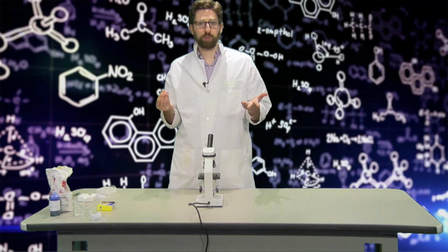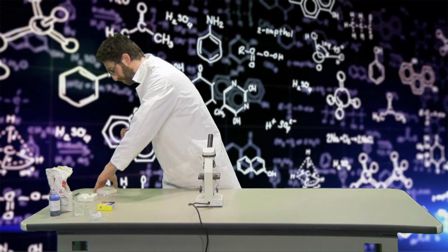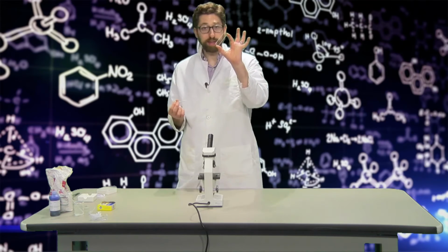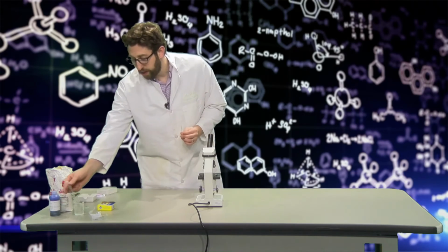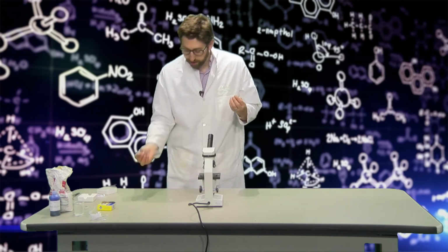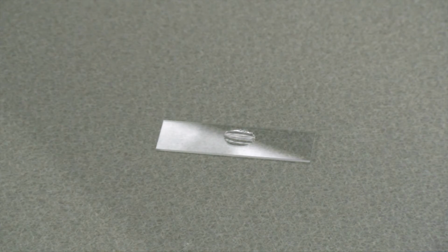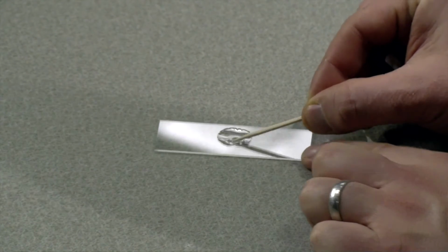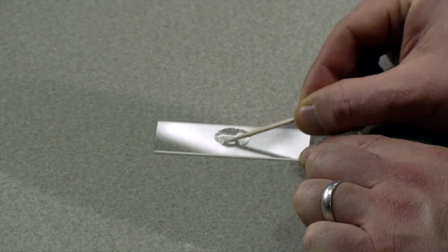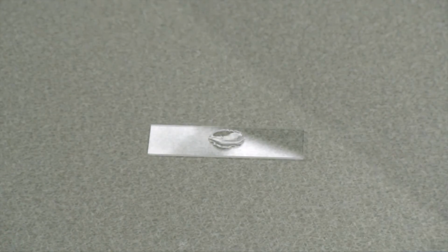I need to make another microscope slide. Let me get another one. Remember, I always pick these up by the edges. I'm going to put it down carefully. And in the middle of my slide, because I'm making another wet mount slide, I need to put another drop of water. Perfect. And I'm going to swish the end of my toothpick that was in my mouth on that drop of water. I'm now transferring what the sample was that came from my mouth onto this microscope slide.